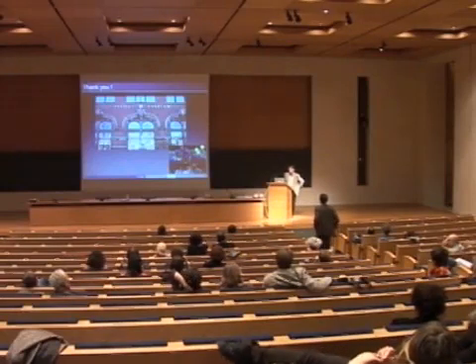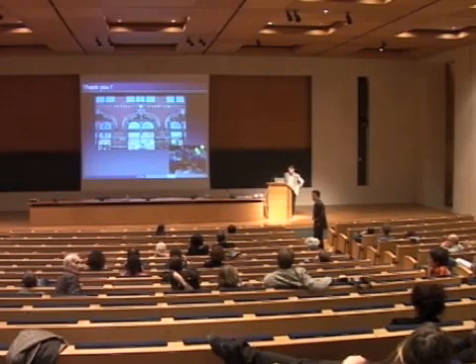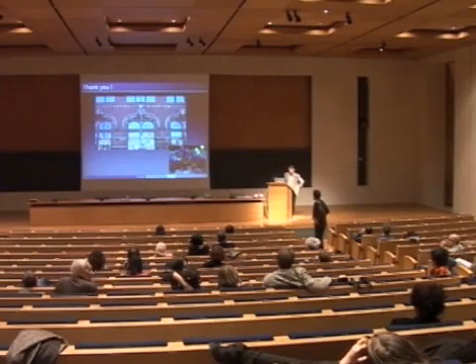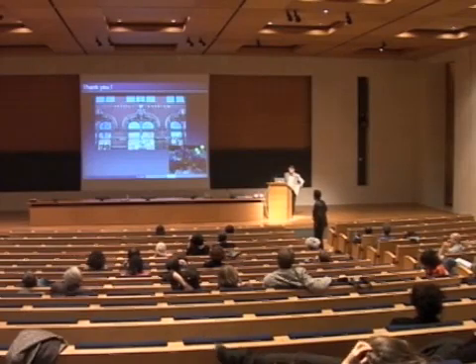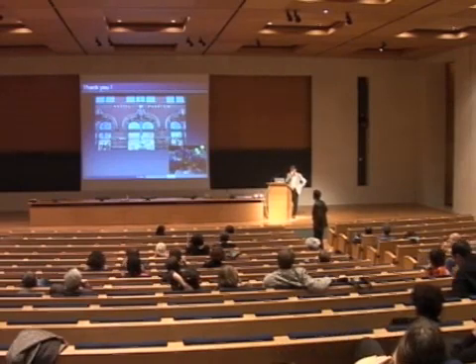I just have a question because I think that atomic force microscopy has been used for visualizing nucleosome structure. Particularly, Stefan Dimitrov in Grenoble is doing that kind of experiment. So do you think that the technology is now mature for visualizing some chromatin state in living cells?